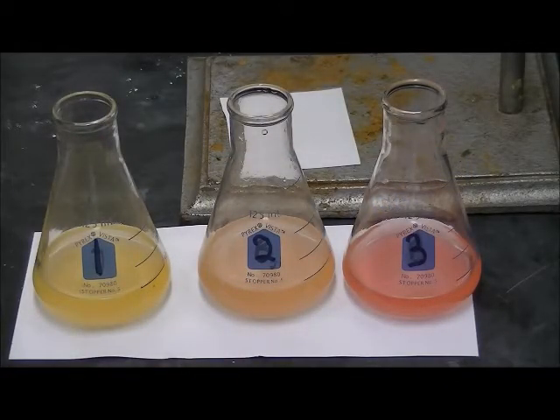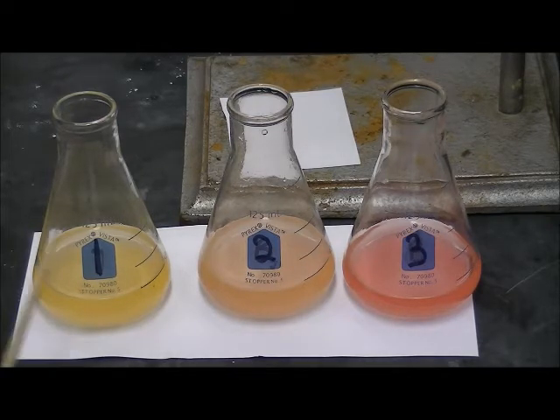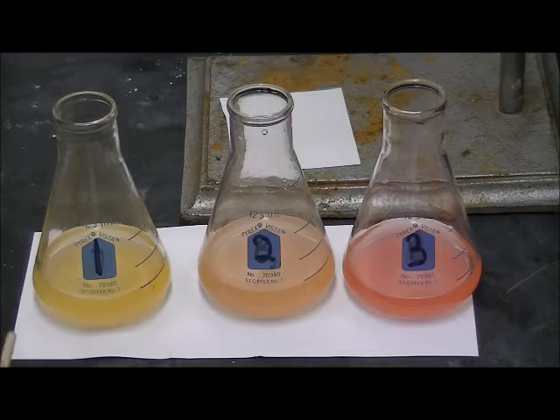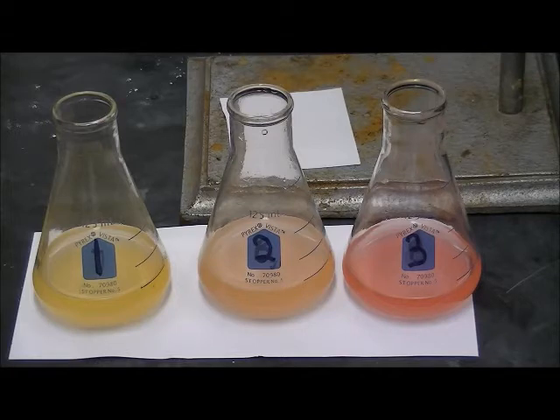In looking at the three samples from unknown B, it appears that the first one lost its color with sitting so it may have been under titrated a little bit. Sample 2 is just turning like it should be. And sample 3 looks like it was over titrated just a little bit. Something to think about when you're doing your calculations.